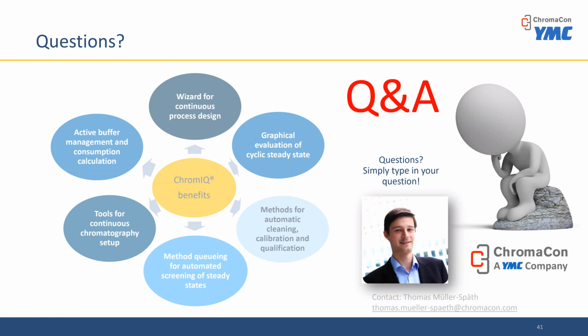Yeah, so there's no feedback control for the conductivity before it enters into the system. So that's not there on the Contichrom system. On the scale-up system, that's possible. So basically, this is done a priori by calculation.